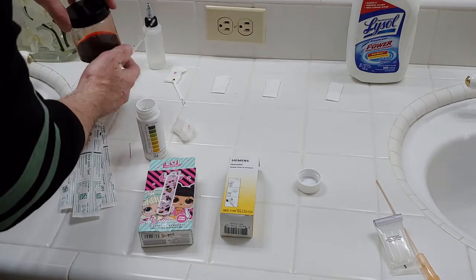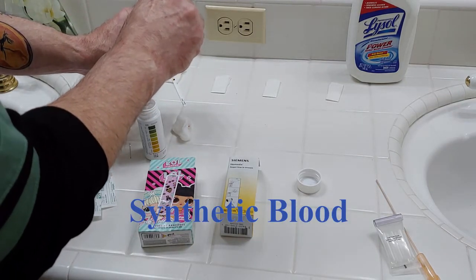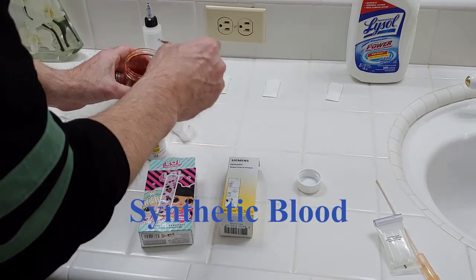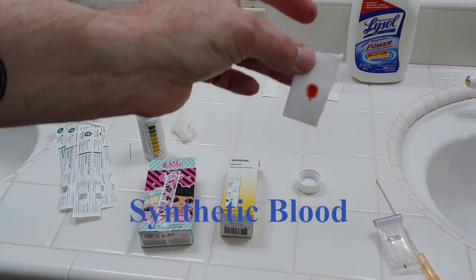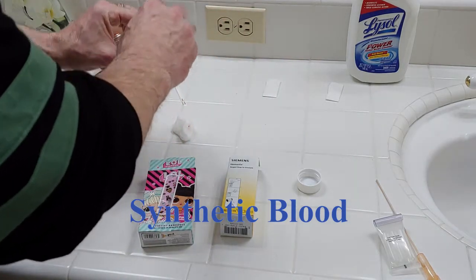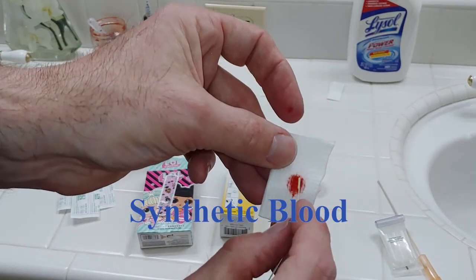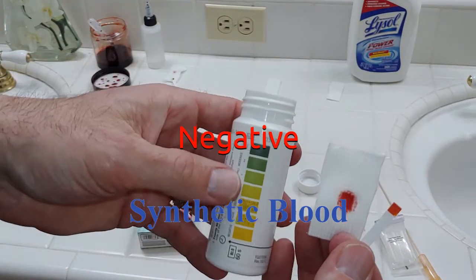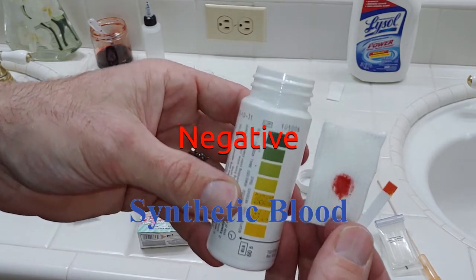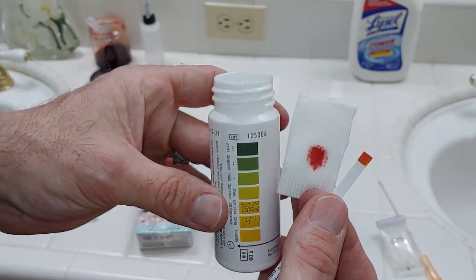Now we're going to go ahead and use our synthetic blood. I've never tested this with the Hemostyx before, so this will be fun to see. It looks very similar to human blood — it's a little less viscous, not quite as thick, but looks almost identical. Just going to apply it to the Hemostyx. No reaction. So that is a good control — there's no reaction. We know this is not real blood. The synthetic blood I use for experiments is not going to test presumptive positive for blood.